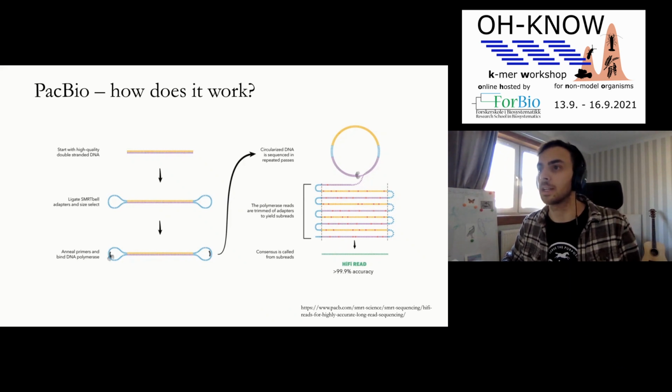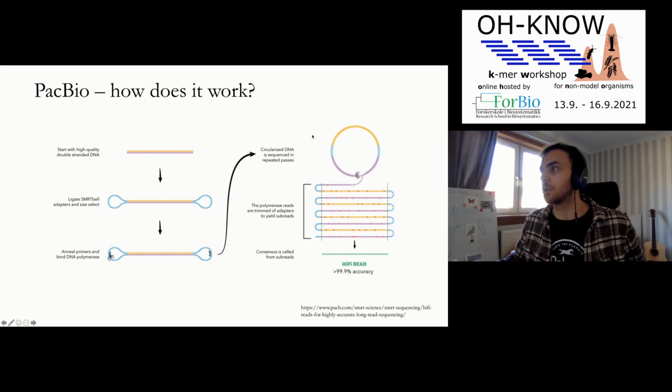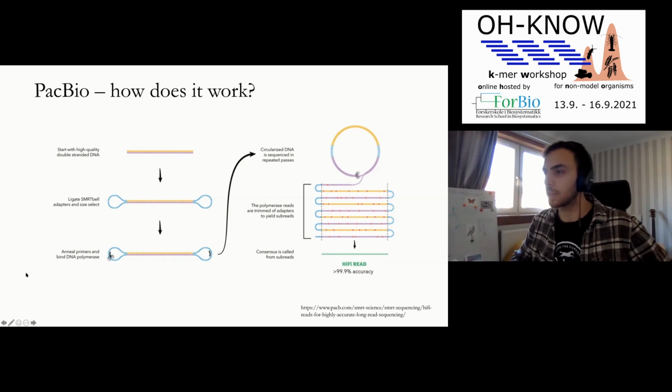So the Pacbio system works slightly differently, where you actually take your double-stranded DNA and you ligate these two different ends on it. This is what they call SMRTbell technology. Basically, this then sits in a sort of well on a plate, and the sequencing bit, which is making the fluorescence happen, is kind of whizzing around this molecule in a circle. And so you can see in this diagram here, you just go around and around and around your circularized molecule. It allows you to actually correct the small errors that there would normally have been. In old Pacbio data, you would end up with these errors. And now you are able to call this consensus read by just going over the same circularized bit of DNA many times.